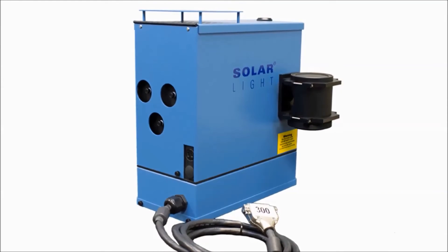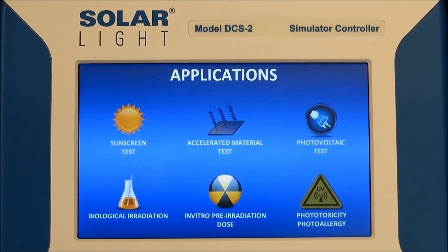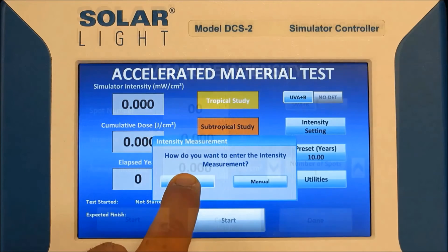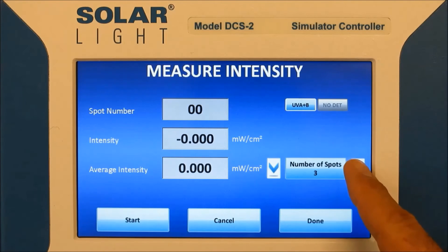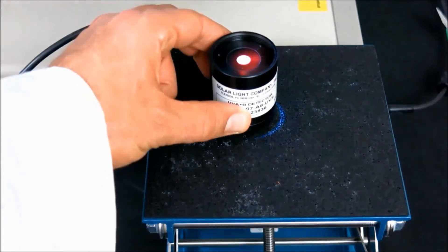We're going to go over the basic setup and operation of this fade and colorfastness testing kit, which is very straightforward and user-friendly. The first step is to measure the intensity of the simulator's spot beam. The DCS-2 controller will guide us through this process. We're going to select intensity setting, and then press measure intensity. From here, we'll choose to measure the actual spot beam. Next we have to select the number of spots we want to measure in the irradiation area. We recommend at least 5 — the center of the beam and 4 outer edges — but you can change the number of spots easily with the DCS-2's keypad. Now we're going to place the sensor in the center of the light path and press start.